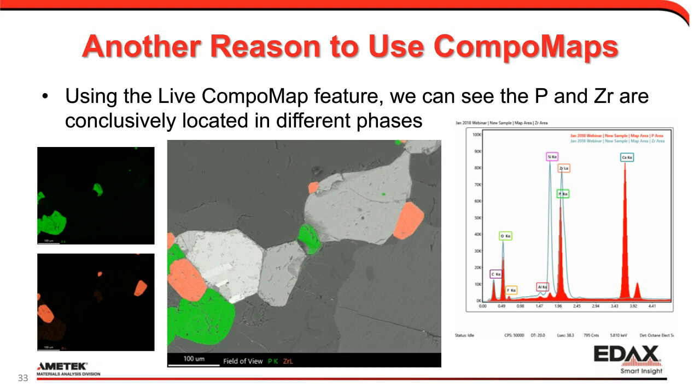And now when we look at it, we could visualize the spectra. We see the spectrum from the green areas and the spectrum from the peach or orange areas, and we can overlay those spectra. And sure enough, look at that nice peak difference between the phosphorus peak and the zirconium peak right in the middle there. They are truly different shapes and slightly different intensities.